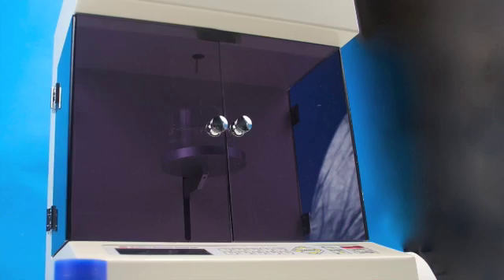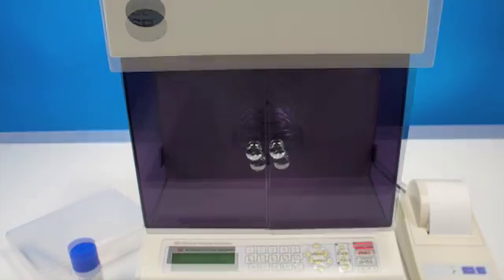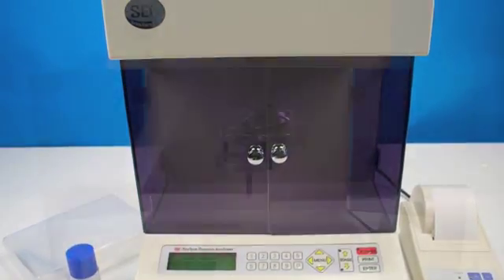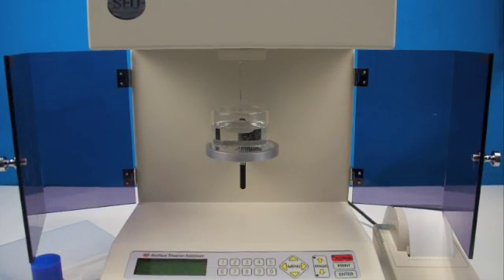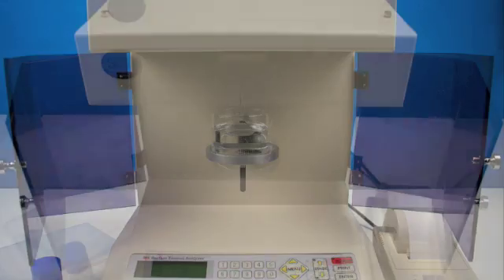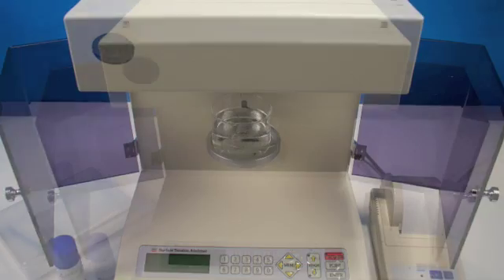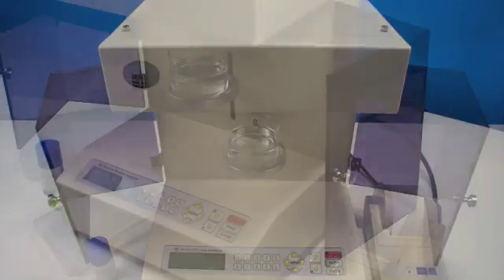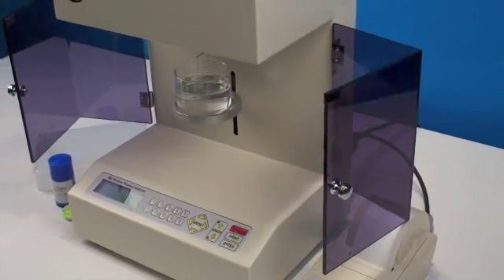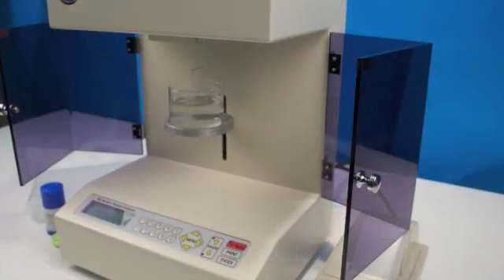The DST-60 Automatic Surface Tension Analyzer offers operators ease of use and the ability to take repeated and accurate measurements with the press of a button. The DST-60 is an automatic digital tensiometer capable of measuring surface tension between liquid and air, and interfacial surface tension between two liquids. The DST-60 can employ either the Denoy ring or Wilhelmi plate method.